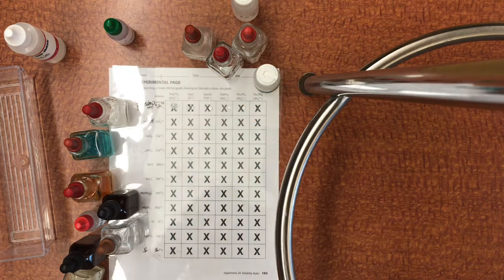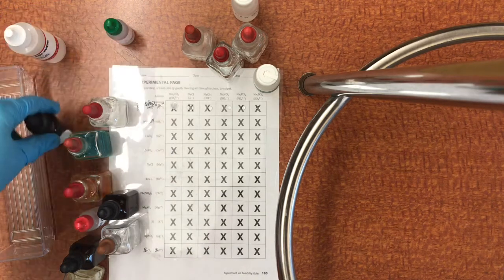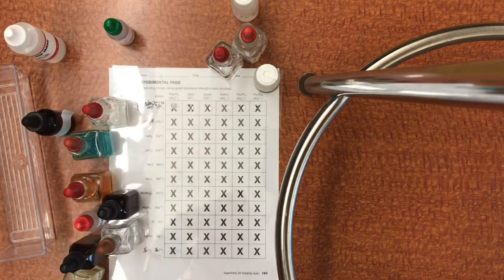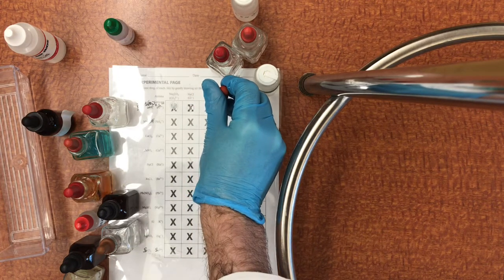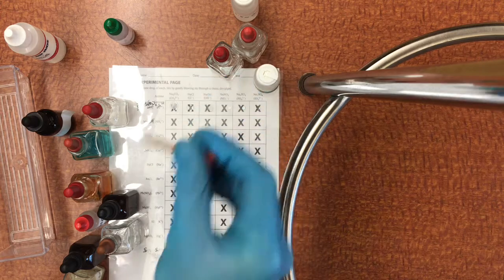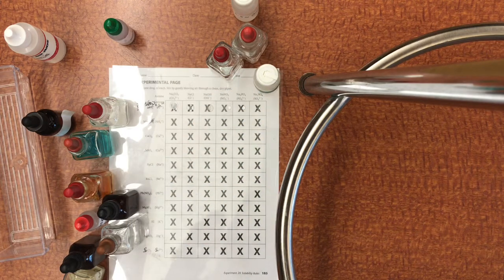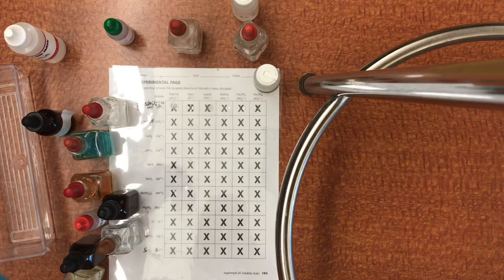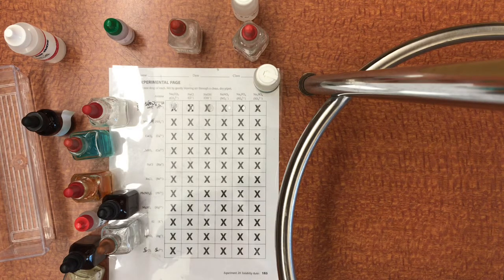And it looks like no reaction. Okay, so chlorides are soluble with most things, so I'm not too surprised that that's the case. Now I'm going to get my sodium hydroxide. Now hydroxides have a low solubility with many options. So let's see what we get here. Yes, you can see the clouding up there and a little bit of a color change as the sodium hydroxide touches.